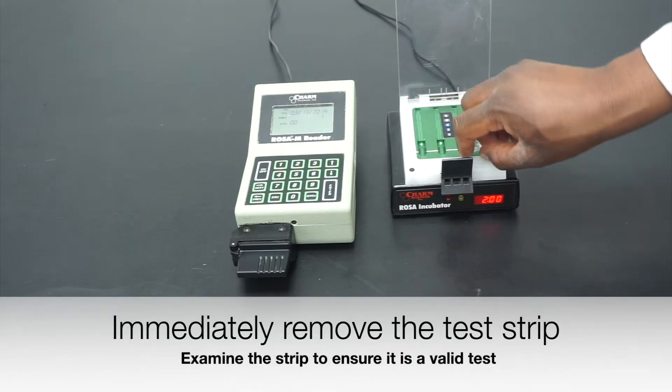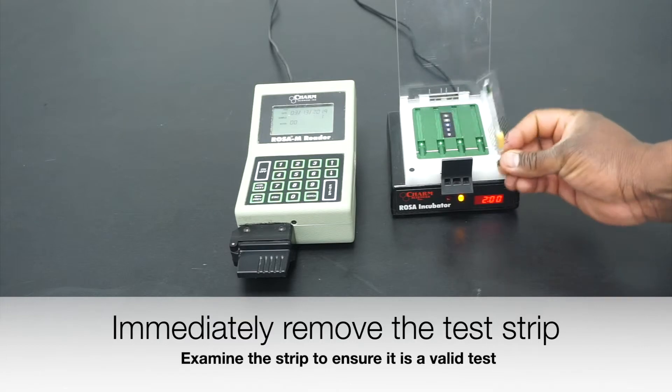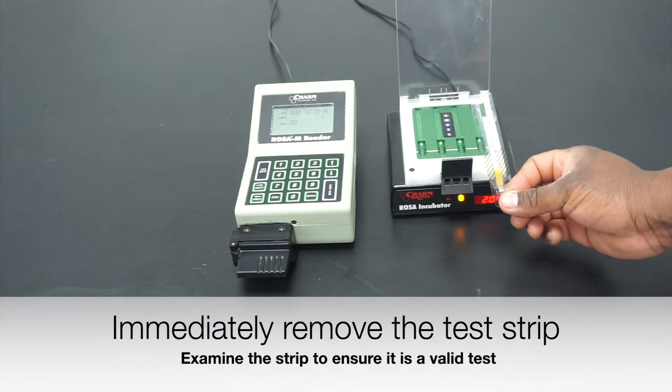Immediately remove your test strip from the incubator in preparation for reading.